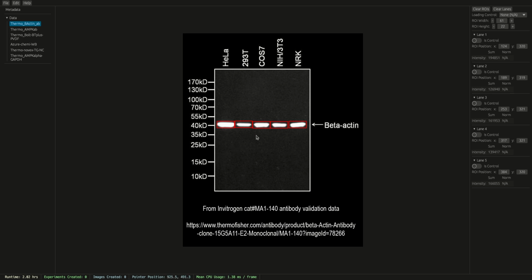Let's say that that is too coarse of an action. You can go over to the tool panel and manually edit the XY pixel position. Let's say the one region I just moved around is associated with lane 2 per our tooltip. I can go over to lane 2, and let's say I actually want to move it up 2 pixels. So I'm going to subtract 2, and you can see it was relocated. I'm going to move it back. And so that's your movement control. It's either click and drag or edit the pixel position on the right.